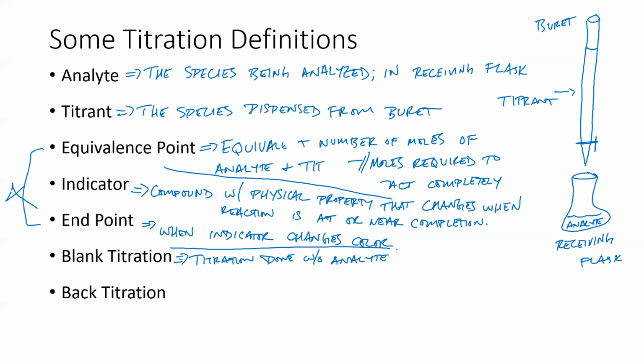Okay, say that it takes 0.21 milliliters for plain water and a drop or two of phenolphthalein to go from colorless to magenta, right? Just a super tiny amount. Well, if that's the case, then that's how much base is necessary to neutralize our water and to affect a change in our indicator.